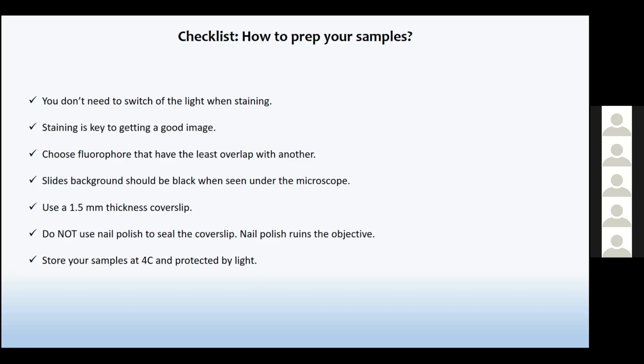Again, if you're using glycerol, please remember that glycerol takes a lot longer to cure, so you might want to keep it out for at least a day or two. Long-term storage of your samples should be at 4 degrees, protected from light.